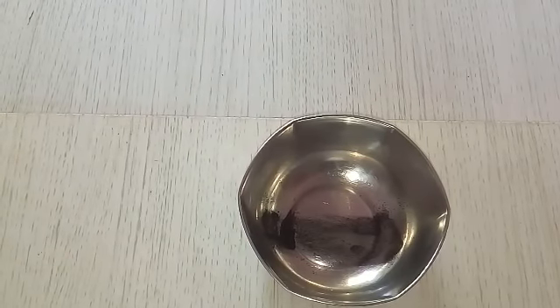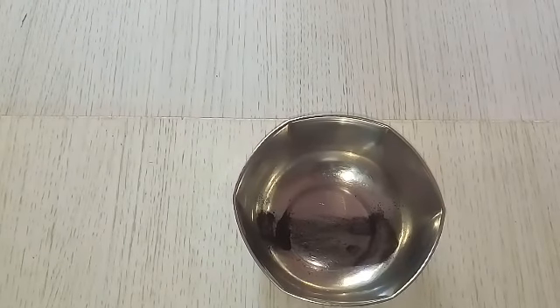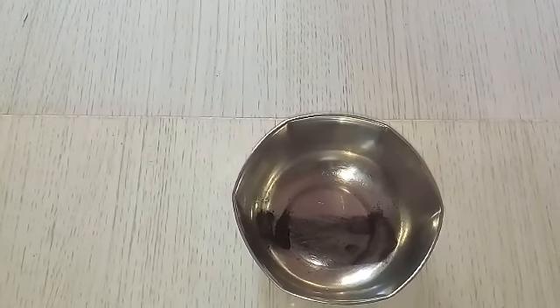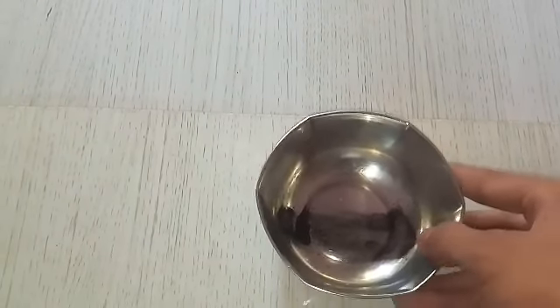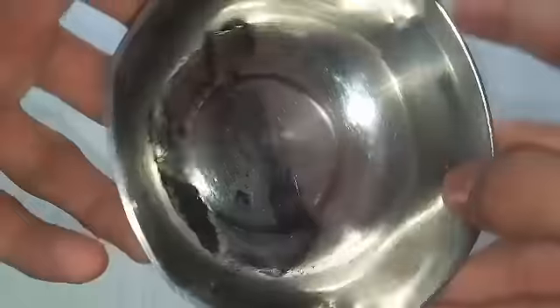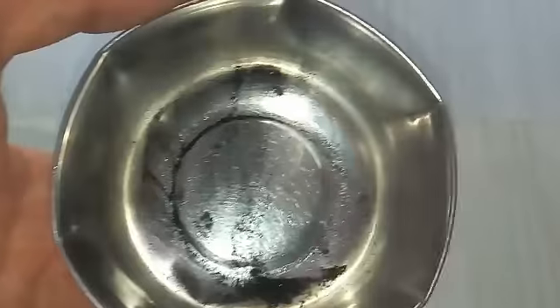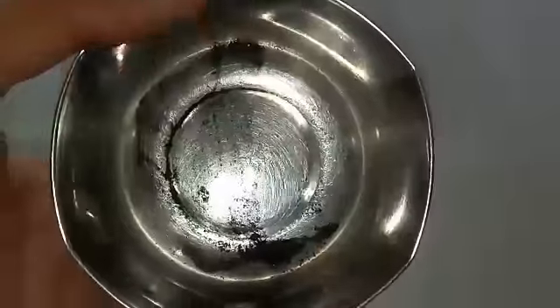Okay guys, I'm back here in my lab, and I haven't shown you what I have did with that cup with carbon. But what I did is I take a spoon and scrape off each and every area of the cup to get as much carbon as possible, and this is what I was left with. You can see a very uniform, some black powder of carbon which is very pure. And this is not directly, I have cleaned that carbon before, which I have collected from that cup, and I haven't also shown you the cleaning process.